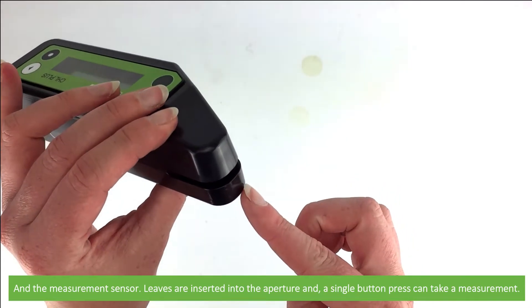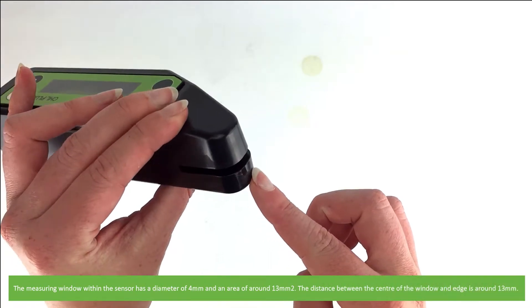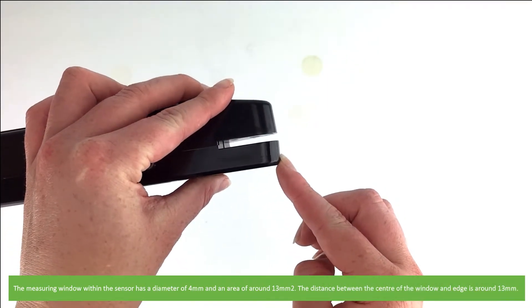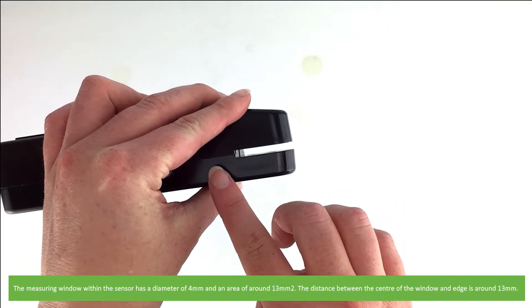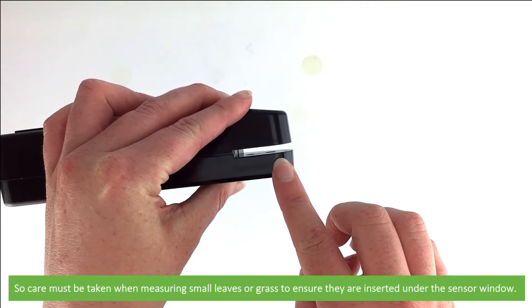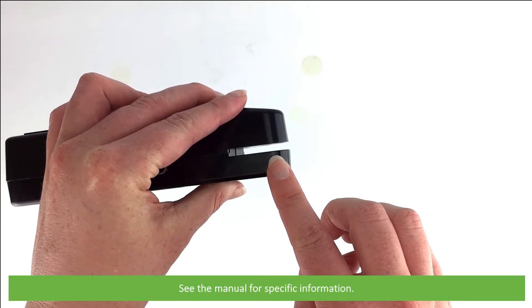Leaves are inserted into the aperture and a single button press can take a measurement. The measuring window within the sensor has a diameter of 4 millimetres and an area of around 13 millimetres squared. The distance between the centre of the window and the edge is around 13 millimetres, so care must be taken when measuring small leaves or grass to ensure they are inserted under the sensor window. See the manual for specific information.